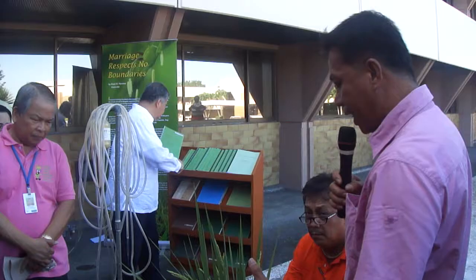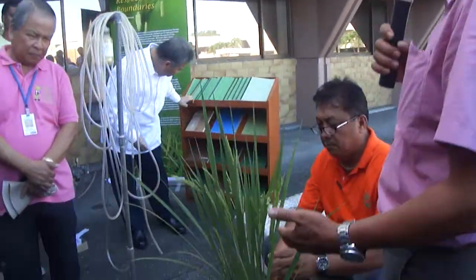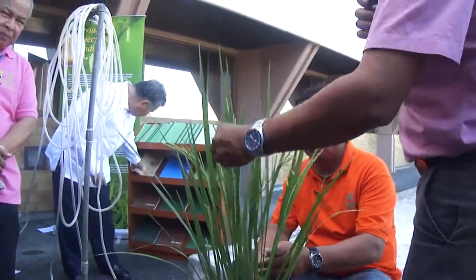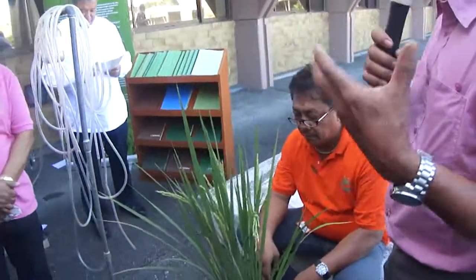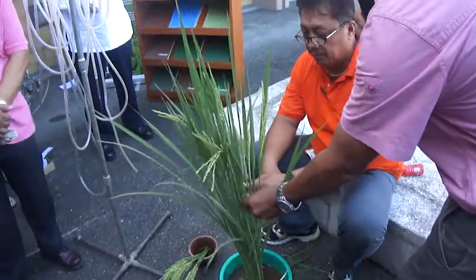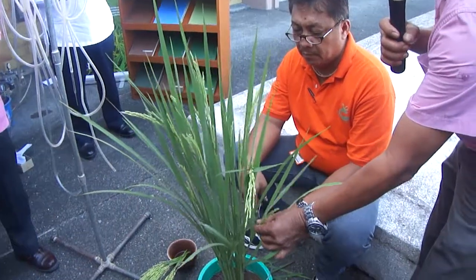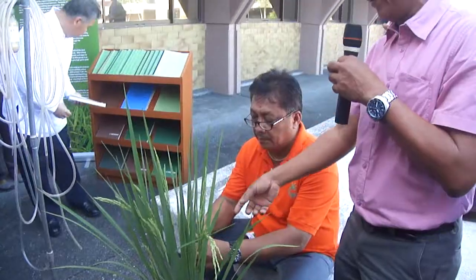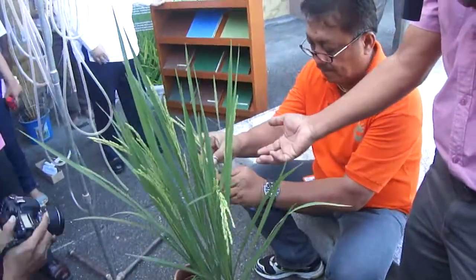So after selecting the best plants, we look for the best stage of the flower. If 100% of the flowers are open, they've already undergone self-pollination. As you know, rice is a self-pollinated crop. So we will select only those flowers where 50% of the panicles are coming out like this. Stoy will show you how to emasculate.